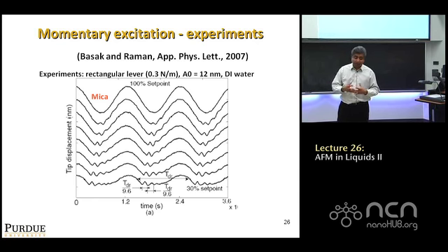Another way is to say, I'm not going to measure how high it bounces back, but I'm going to listen to the sound. So I bounce it off a soft substrate, and I hear the sound.